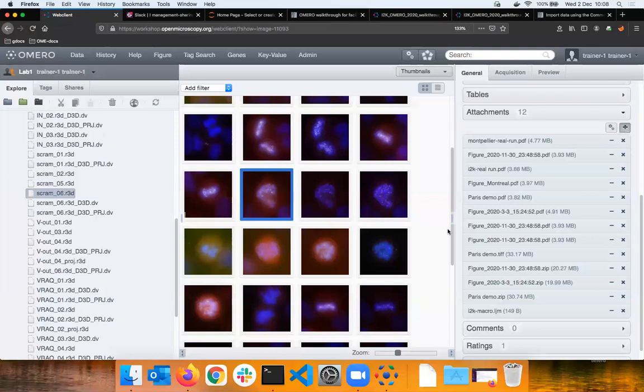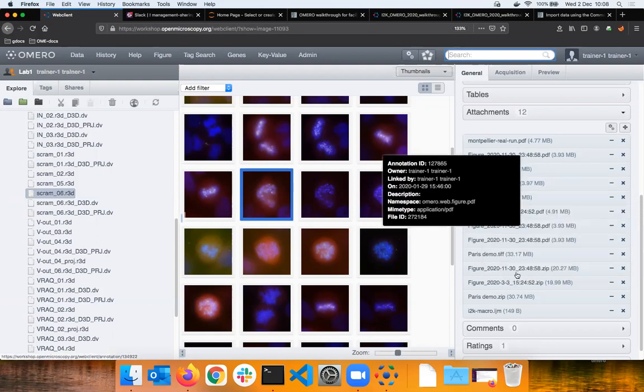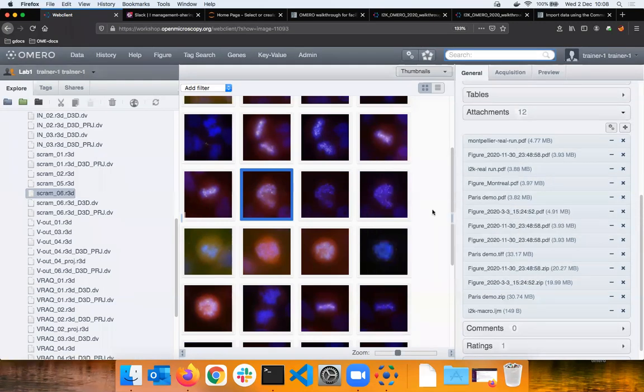You can do the same trick with, let's say, MATLAB or any other third-party software tool which you can connect to Omero. We will go through that in the analysis section. If you add something which rather resembles a descriptive protocol into the attachments, you can take some advantage of that as well. If it's PDF or CSV, the big search, which I've just shown you for key value pairs on the top right, will search in those attached files. If that be a text file or CSV or a simple PDF, the content of that attachment will be indexed and searched by the big search.